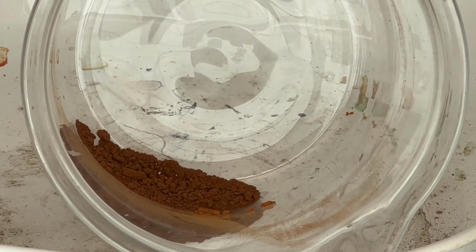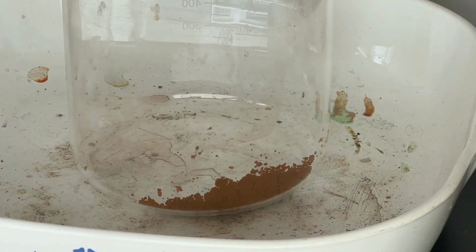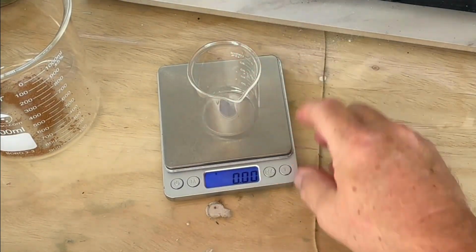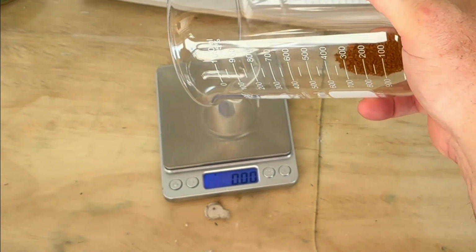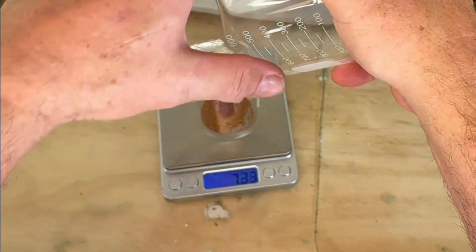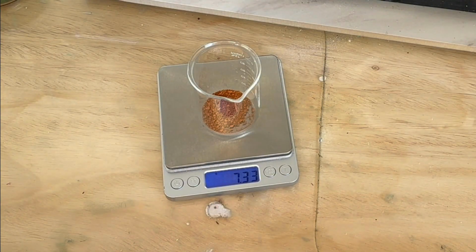All right, so we've done our wash. I've put the powder on a warm dish, not hot. The heat isn't on. The dish has just got leftover warmth on it from the other uses. So let's see what we got here. Going to tare out this beaker to zero. Going to take our dry powder, pretty good looking powder, go in here and see what we come up with. And it looks like we're going to come in right at 7.33 grams.